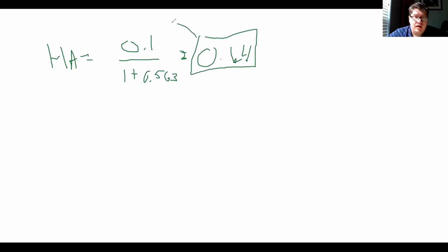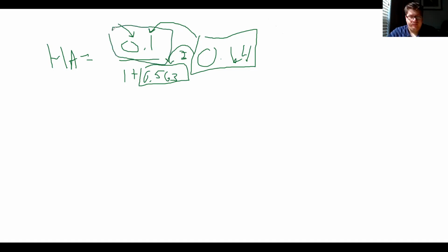Now, we're going to take that and subtract it from this. You're probably asking why that and not this. Well, this is going to be the total of them put together. I want the buffer one. When you add those together, the concentrations will be a bit different because you're changing it because of volume. This is the one I'm looking for right here. Remember, M1V1 equals M2V2. You add two things together, it changes the concentration. So this was the concentration of them together. This is going to be a modified one of our buffer.